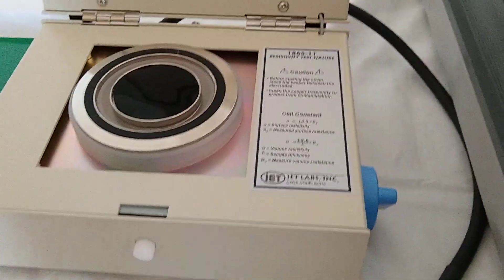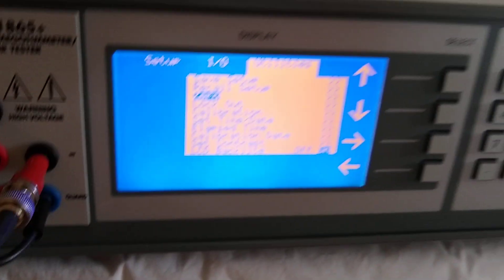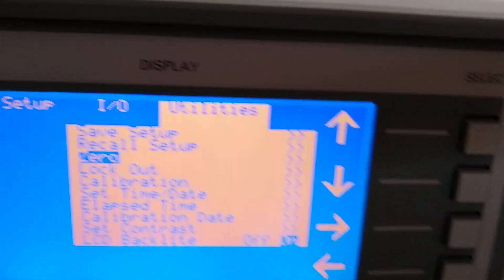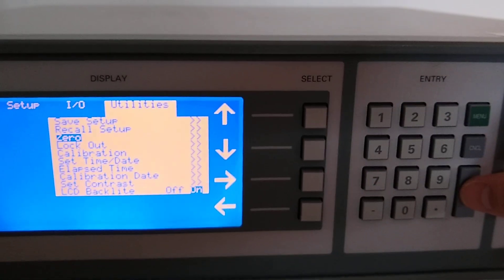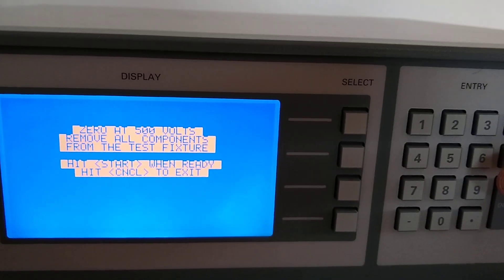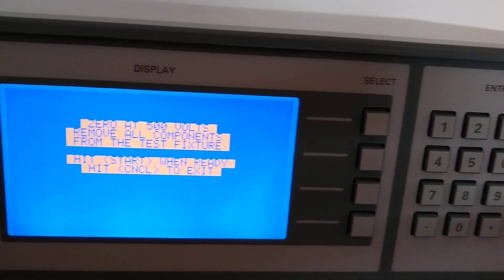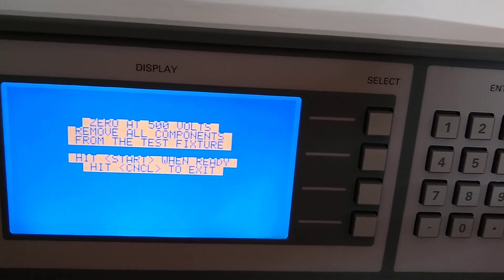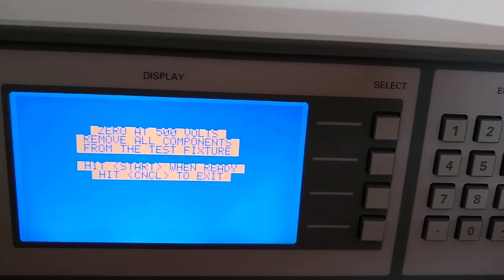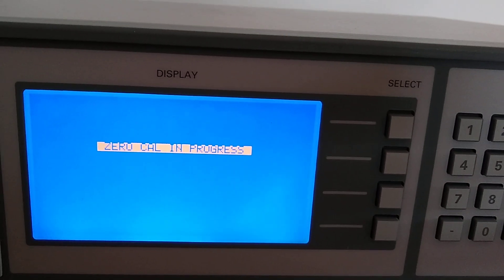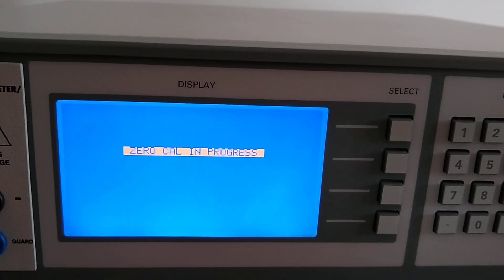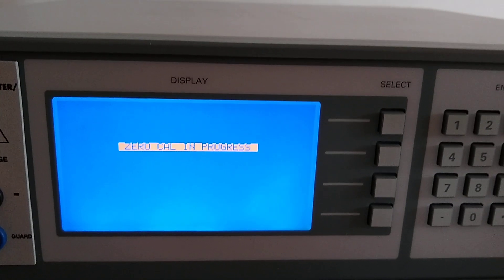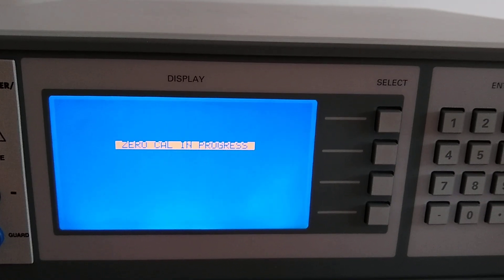Once we've got it set to RV, we keep the cell open. We go back over to the 1865 Plus. At this point, we can press enter to do a zero. It says remove all components from the test fixture, which we've done. We make sure the cell is open. We hit start. It says zero cal in progress. This takes about two and a half minutes to complete.